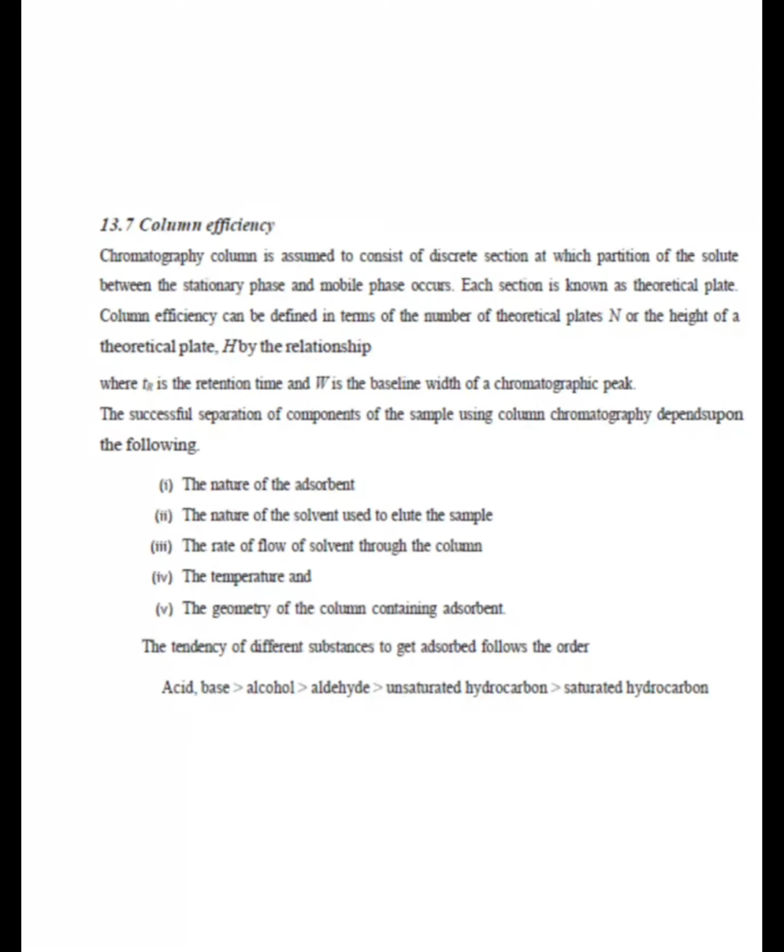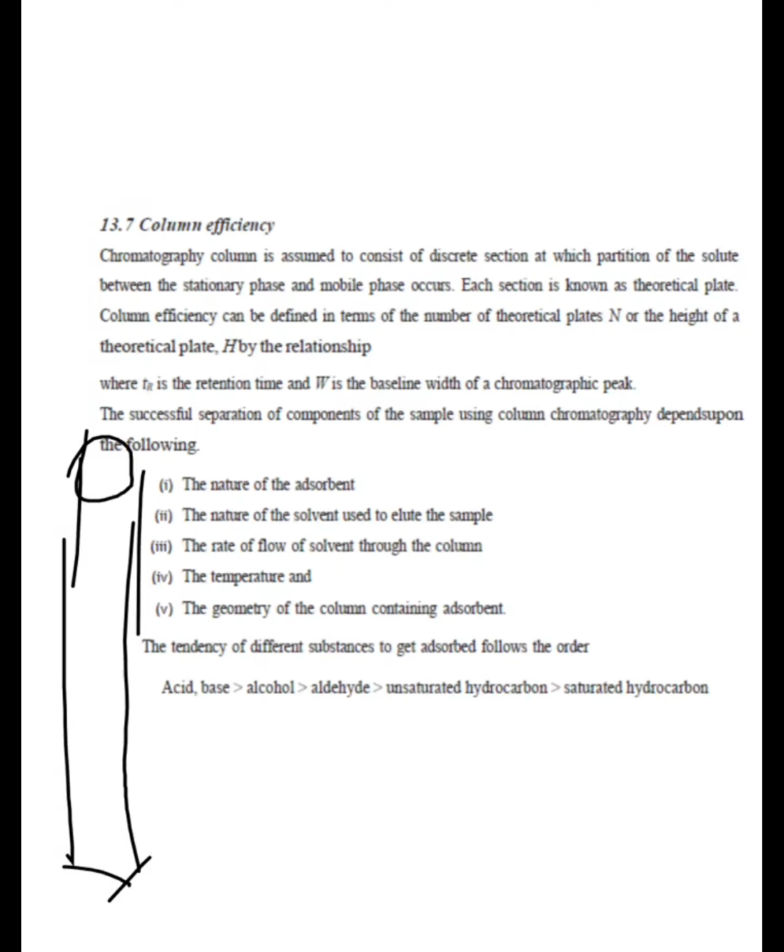The column is divided into different bands or theoretical plates here.